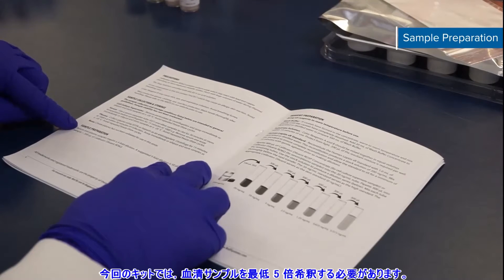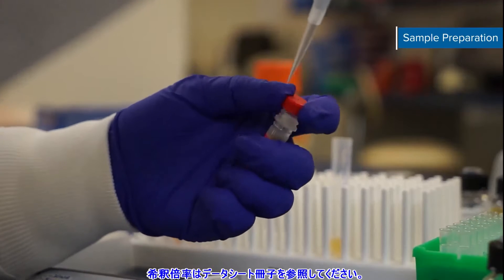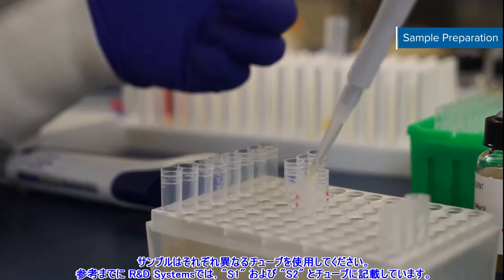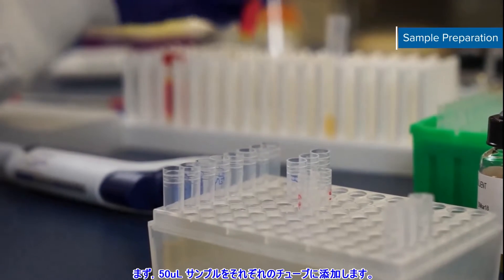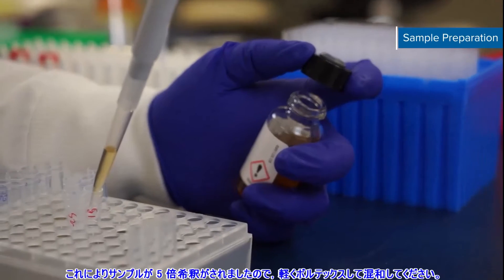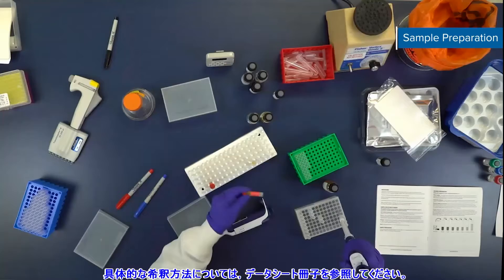This leptin receptor assay requires a minimum 5-fold dilution for your serum samples. Check the sample preparation section of your kit booklet for the suggested dilution factor, if applicable. Use a separate tube for each sample. We've labeled our tubes S1 and S2. First, add 50 microliters of sample to the respective tubes. Then add 200 microliters of calibrator diluent RD6Q to each tube. This produces a 5-fold dilution. Vortex gently to mix. Refer to your kit booklet for specific dilution instructions.